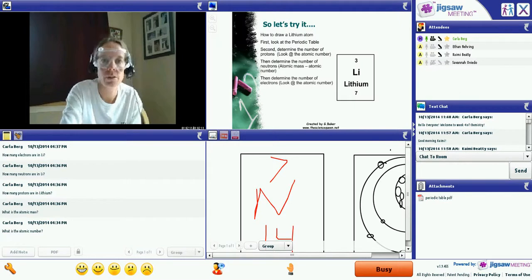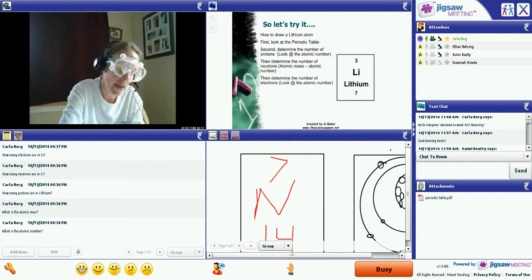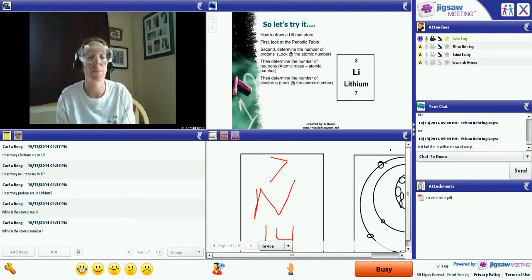Okay, Savannah, I know you are going to do it after class, so we're not going to worry about timing yours. Okay, so it's 1:03 on my clock. So take your solutions, and we're just going to leave them right there. Don't do anything with them. Okay, we're not going to look at anything right now, Ethan. We're going to let them sit for 5 to 10 minutes, and then we're going to make our observations.